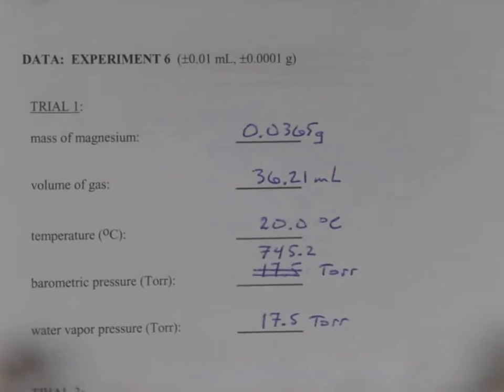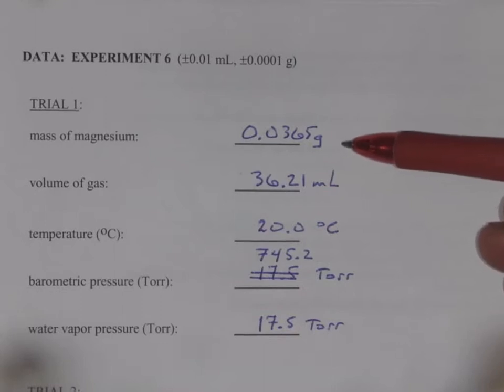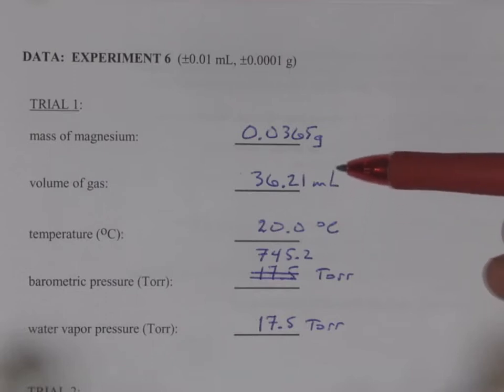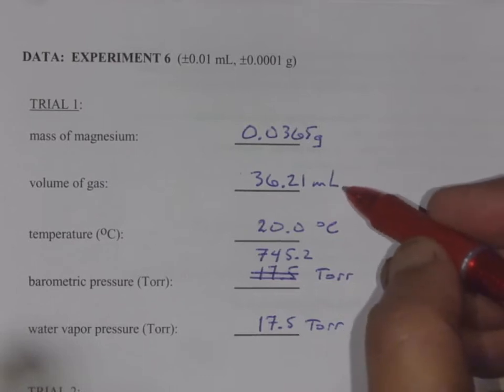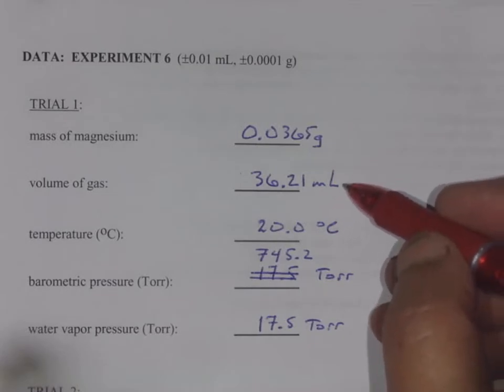So collecting the data, here's some contrived data. And what we're going to do is just run through the mass of magnesium for trial one, 0.0365 grams. Go ahead and write that on your data sheet. Pause as you need. The volume of collected gas is 36.21 mLs. And recognize this gas is not just hydrogen, but it's also water vapor because the hydrogen has bubbled through that test tube full of water. Yeah, that's the volume, but it's a mixture of things.